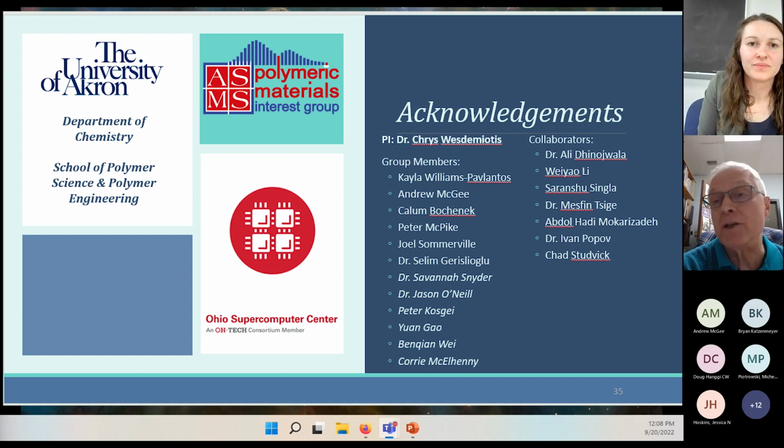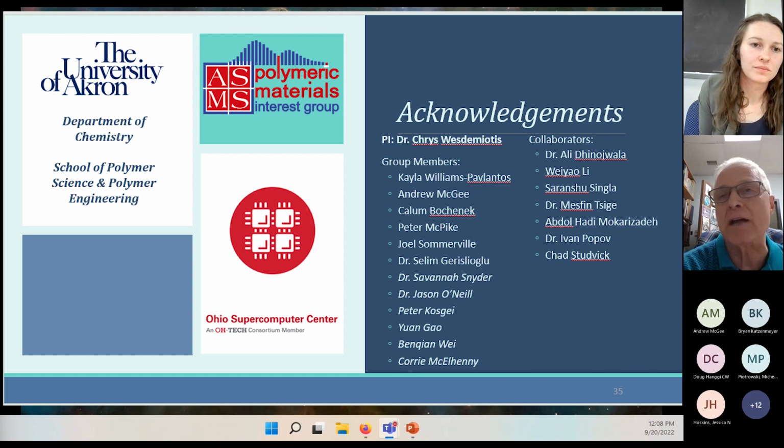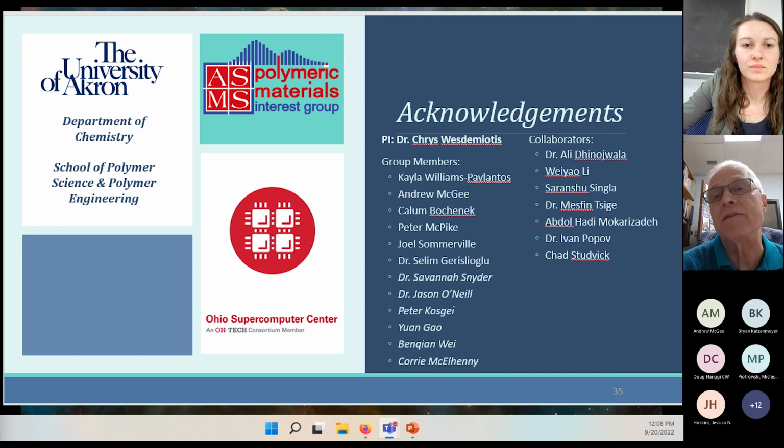But I think in combination with that, it would be very useful. GPC is dependent on standards. For most people it doesn't matter whether they use polystyrene standards or not, they report whatever they report. But sometimes if you need more accurate molecular weights, then your technique would have an advantage.